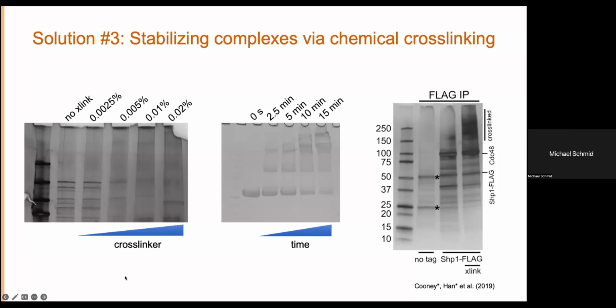So we have a couple of other questions in the Q&A. Is this similar to GraFix, the gradient fixation? Do you need to ultracentrifuge the glutaraldehyde treated species? Good question, Carl. Thank you. So GraFix is basically a very clean and refined version of chemical cross-linking, because now you're also separating your contents out on an ultracentrifuge too.